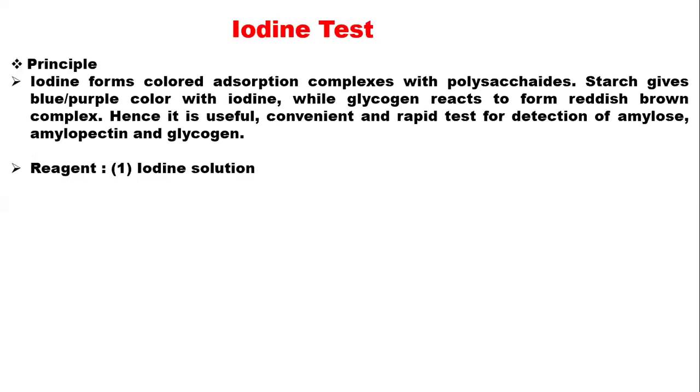The principle here is actually based on what we call iodine molecule entrapment. Here, for polysaccharides, let's say starch and glycogen, we have what we call amylose and amylopectin. Amylose is an unbranched chain of the monosaccharide units found in either starch or glycogen, for instance glucose.